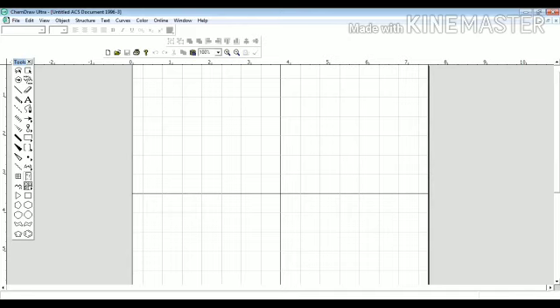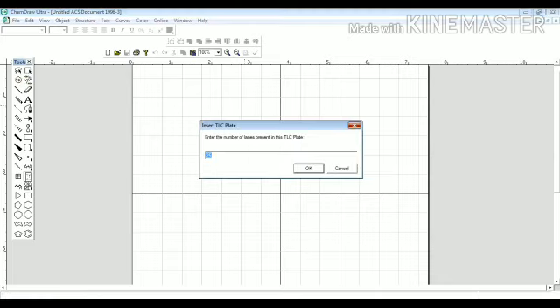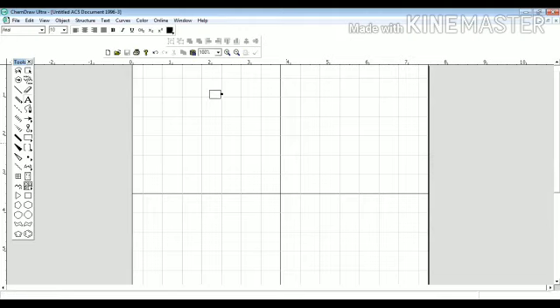Before starting, let me tell you about the tools. These are the tools. This is called lasso. This is the text box. You can type anything over here, like methyl. And this is the lasso tool. It can be selected like that. And this is marquee. This also does the work of selection. Then there is the mass fragmentation window. I'll tell you its use later on.